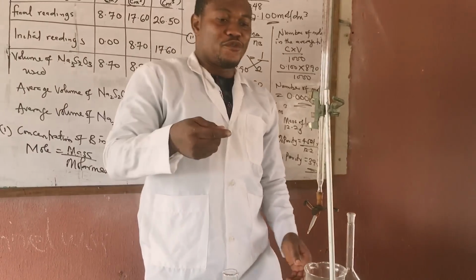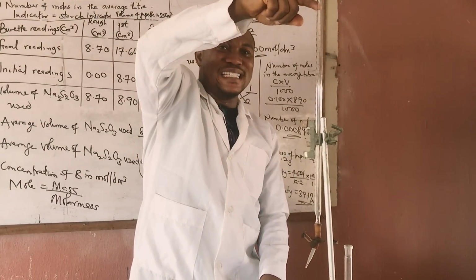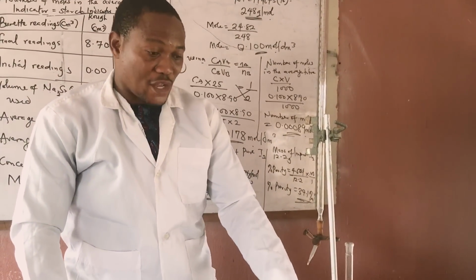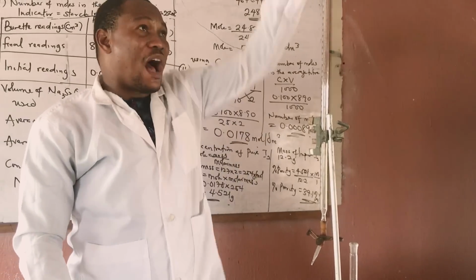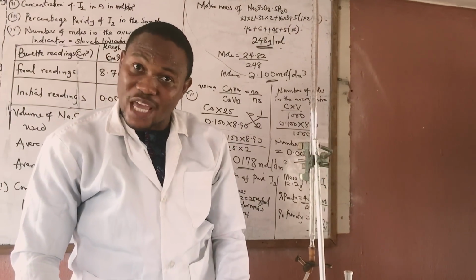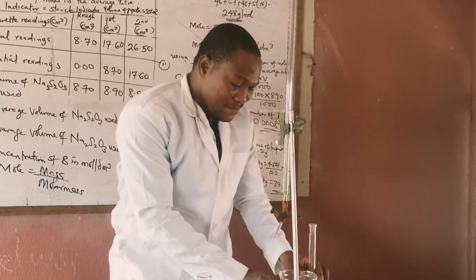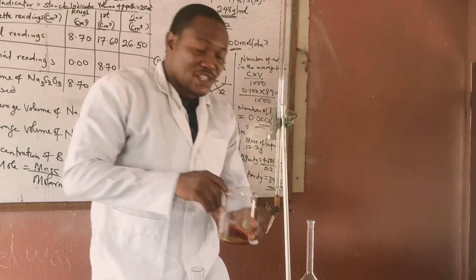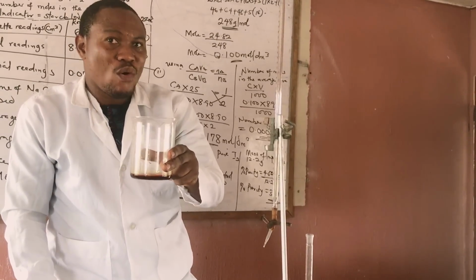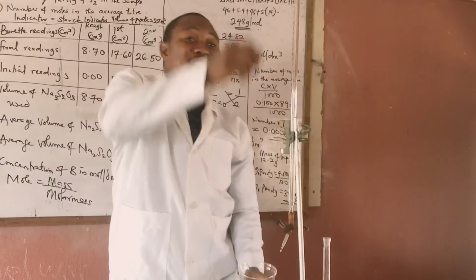If you put the iodine in this, you will not have a reaction. Yes, I don't have enough iodine again. I would have done that. You will finish everything here and it will not change. Okay, because it is simple. Because the potassium iodide that is there is very small. So the concentration of iodine, I have done that when I started the video, is small. So it might not actually have a solution.